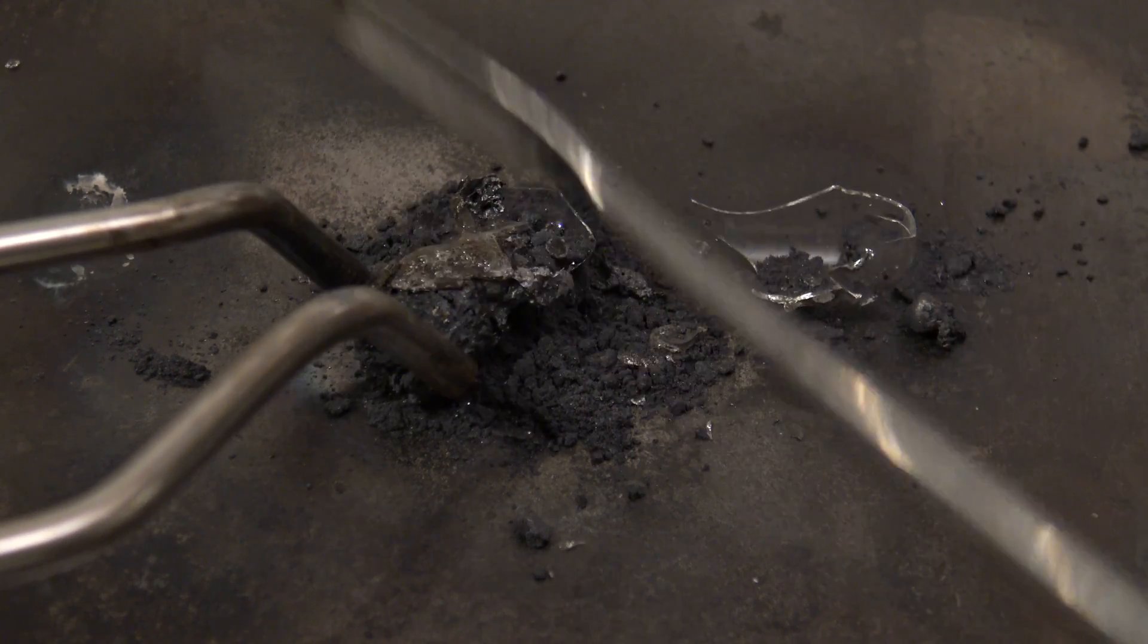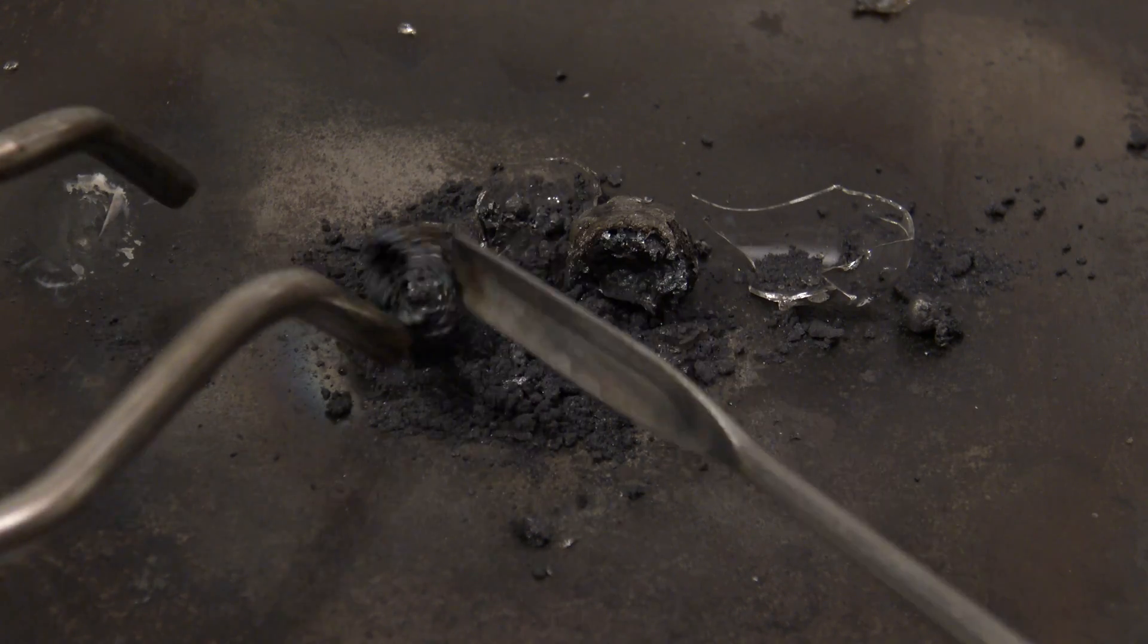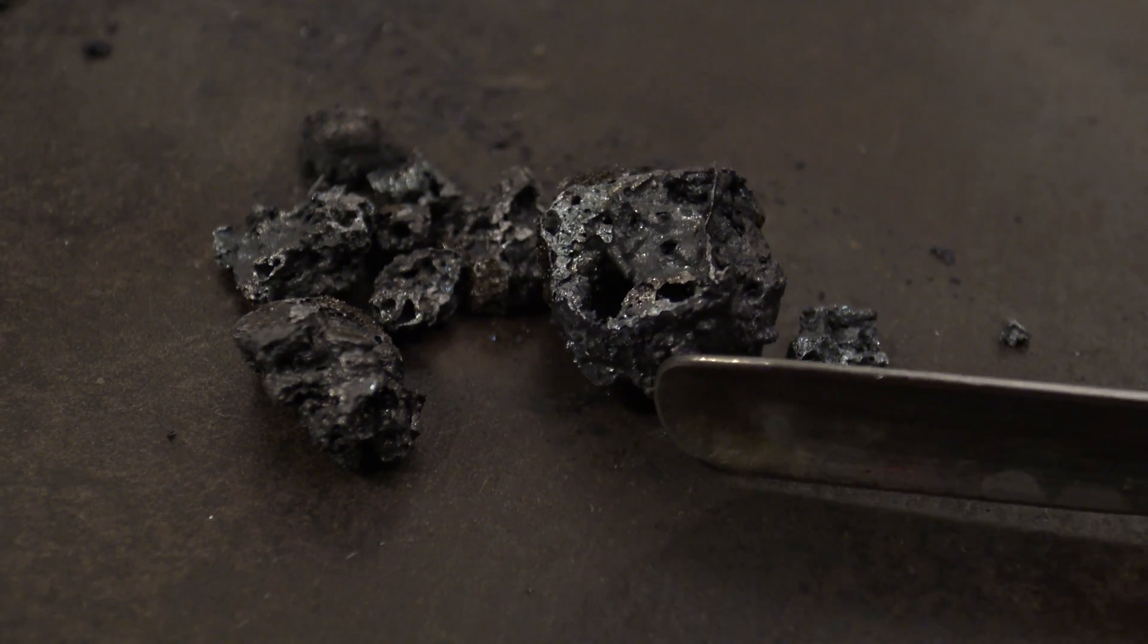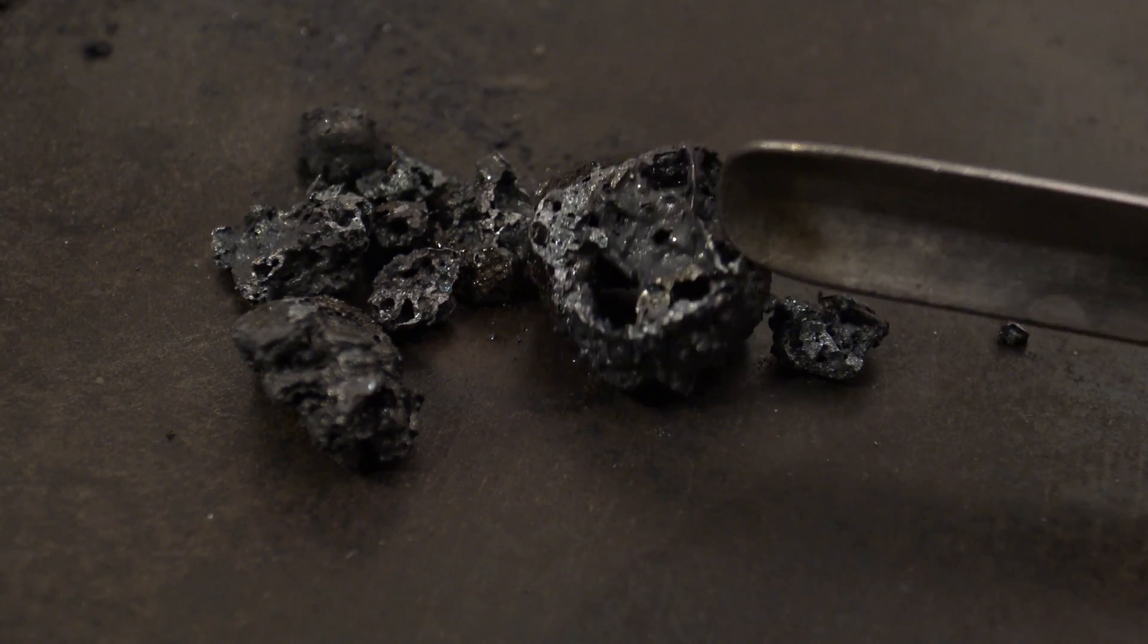The calcium disilicide was quite hard, but also brittle, which made it easy to break it up. Surprisingly, it had still formed crystals on the inside, despite all the circumstances.